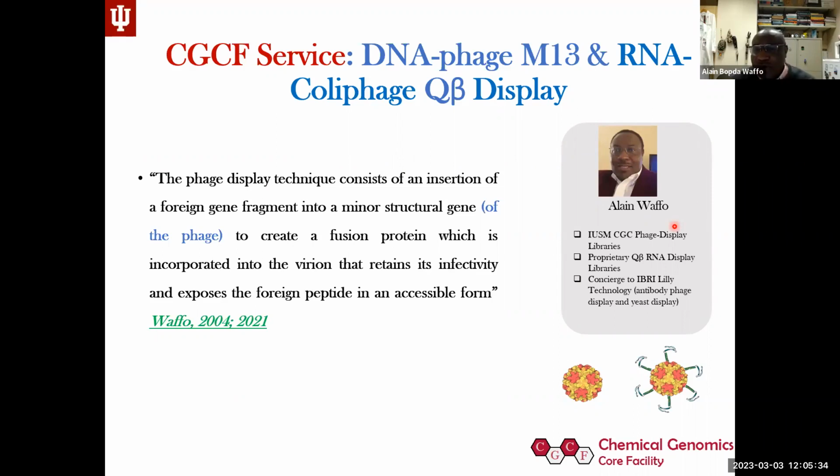Phage display technology consists of an insertion of any foreign fragment, any gene from outside the phage, into the minor structural gene of the phage, so that when the phage is expressed, this gene is also expressed and can be fused with the minor structural protein and then exposed on the phage. Once it's exposed on the phage, it's accessible, it's available for any target. And I can point to things here.